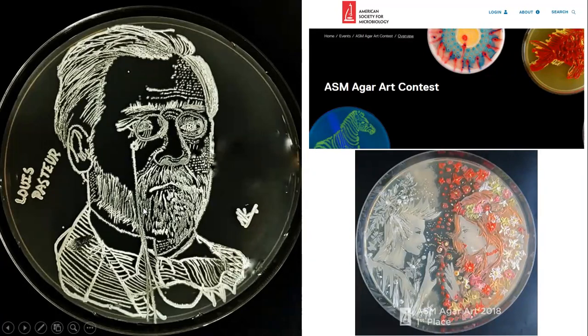I'm very proud to say one of my students, Nanda, has made this picture of Louis Pasteur. This is using a Streptomyces species in actinomycetes isolation agar, and this is his signature, Nanda Kumar. I'm really proud of this picture. And here is an agar art competition conducted by the American Society for Microbiology every year.